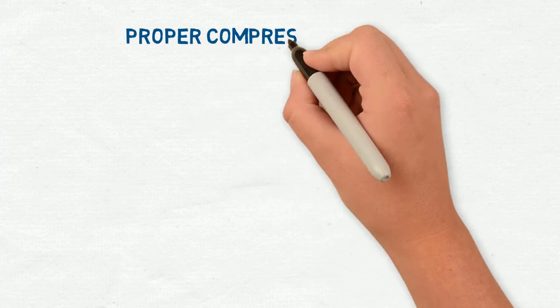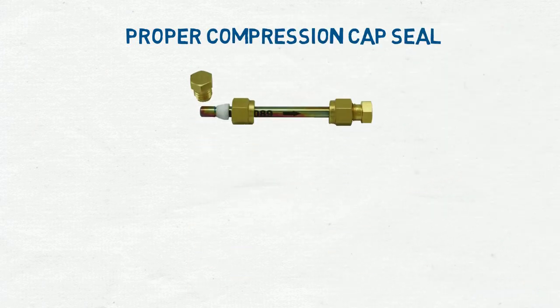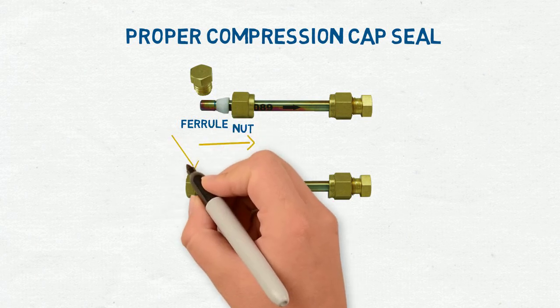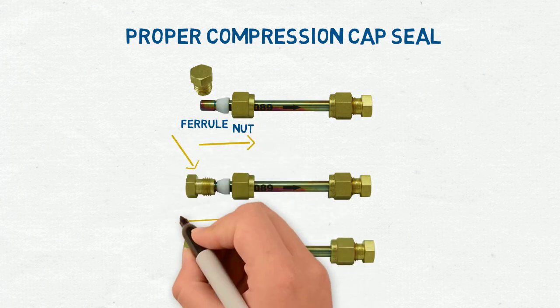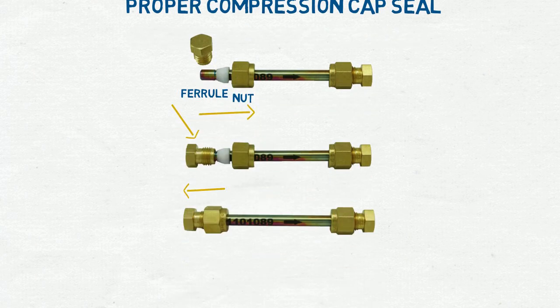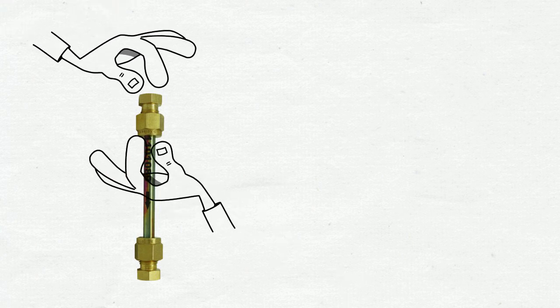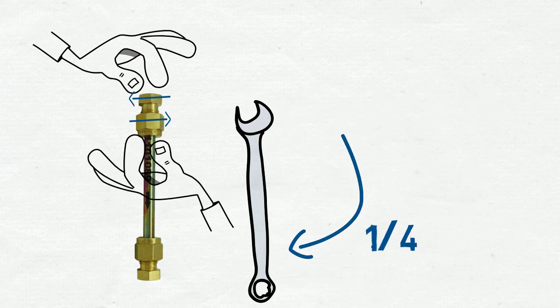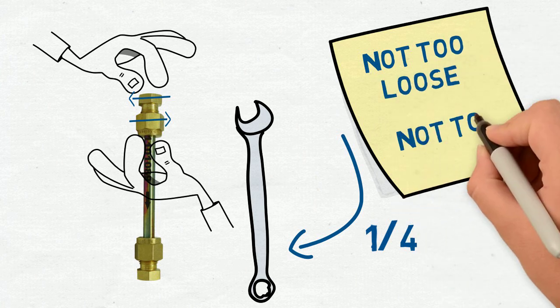To ensure a proper compression cap seal: slide the nut and ferrule partially down the tube, place the top of the compression cap onto the tube, then pull the nut and ferrule up and screw the two pieces together. Hand tighten the compression cap and then use wrenches to tighten another quarter turn. Remember, not too loose and not too tight.